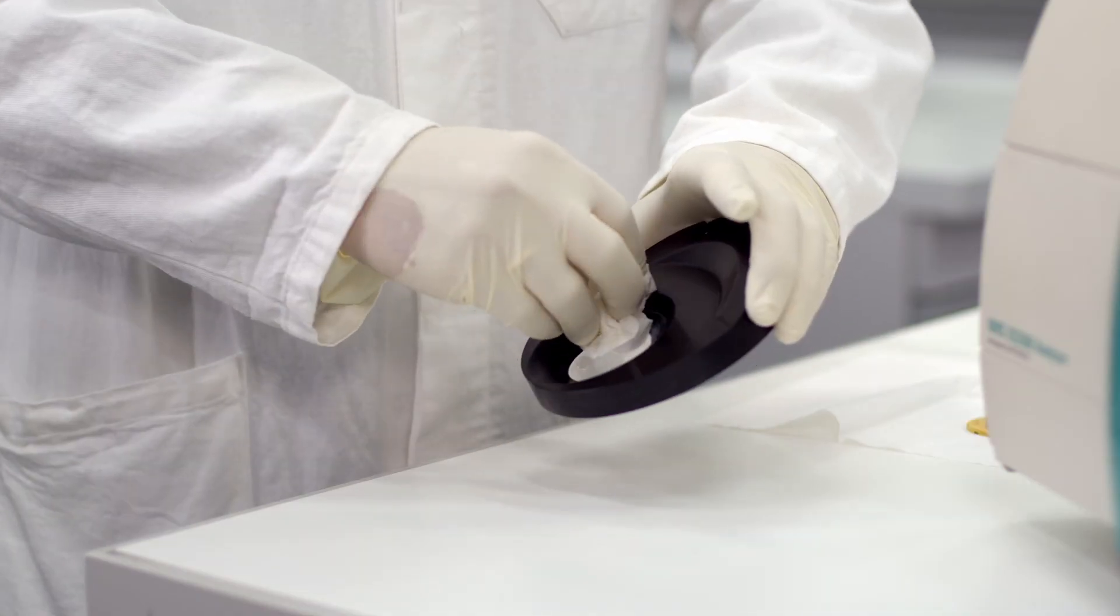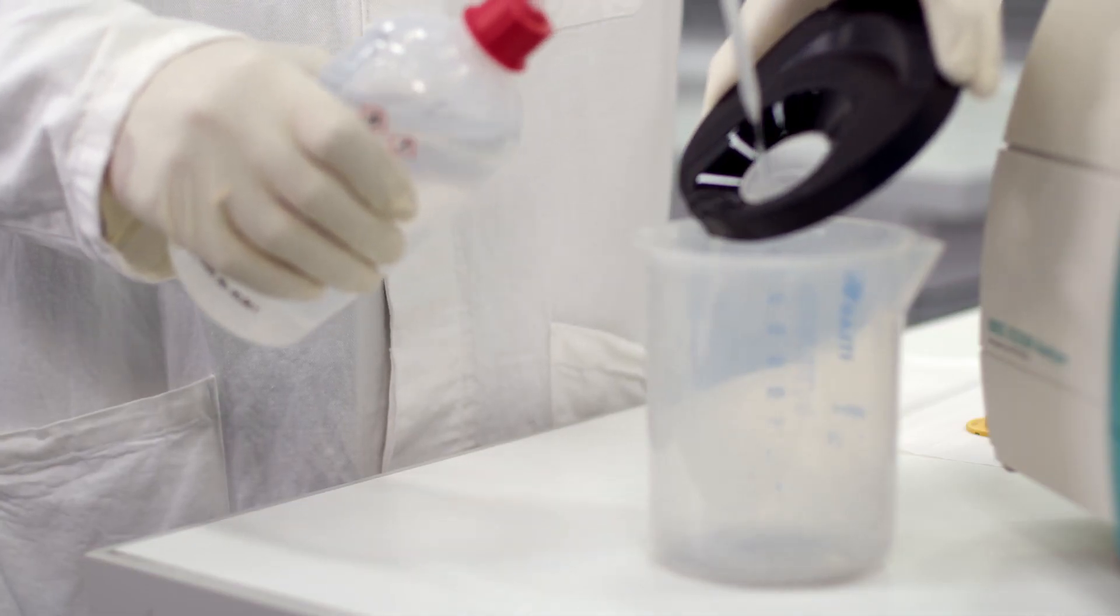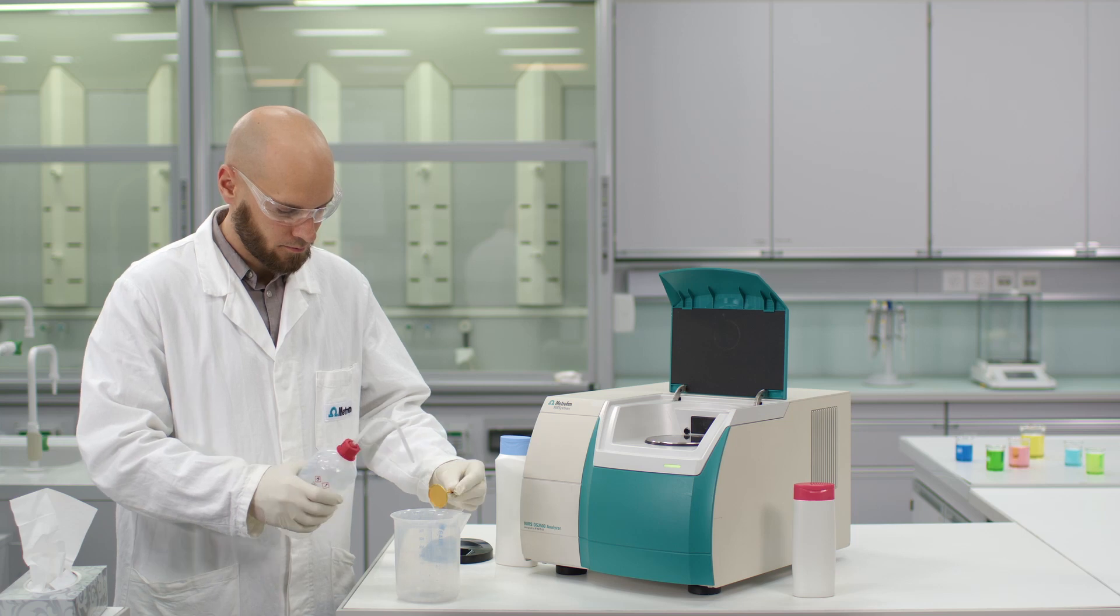Cleaning the slurry cup is very easy. Just remove the sample by wiping with some tissue paper and rinse the slurry cup with ethanol. Then you can use it to analyze other samples.